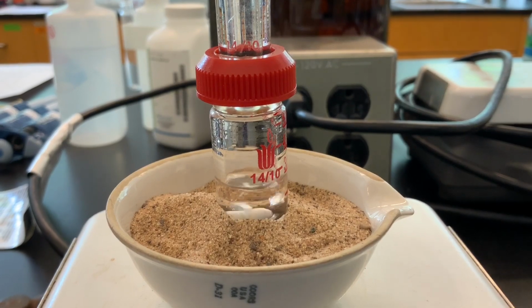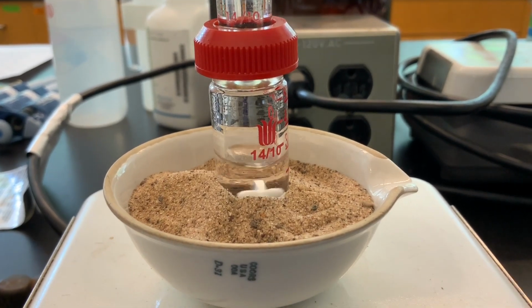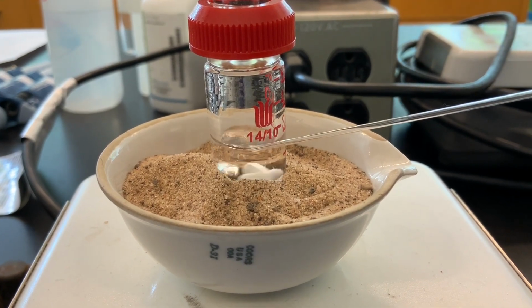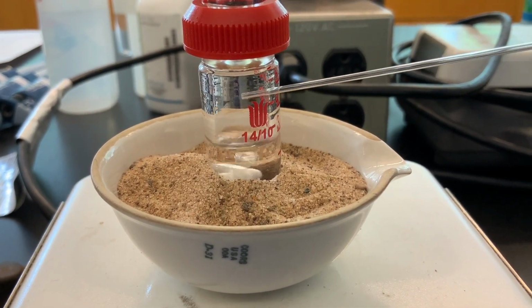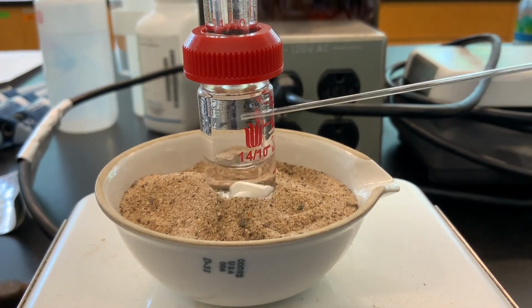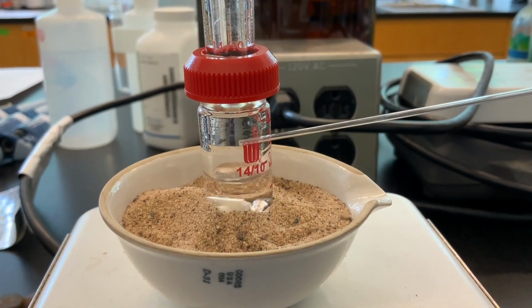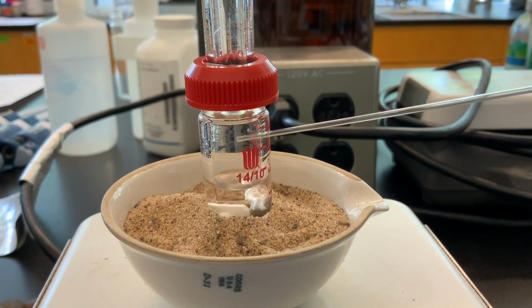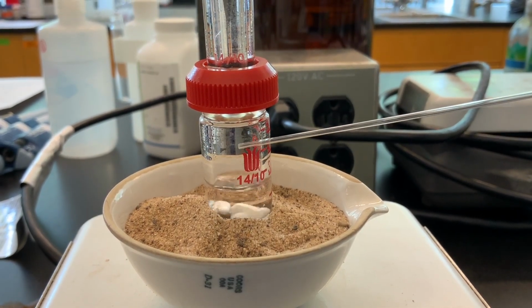Okay, so now we can definitely and clearly see that the vapors of hexane are climbing the walls of the glass, so to speak. So the vapors are condensing on the glass and heating the glass up at the same time.